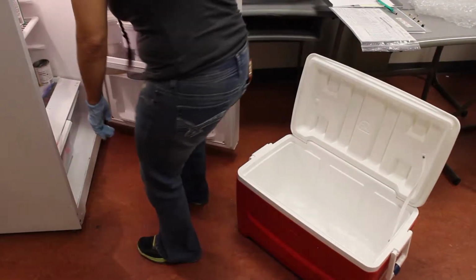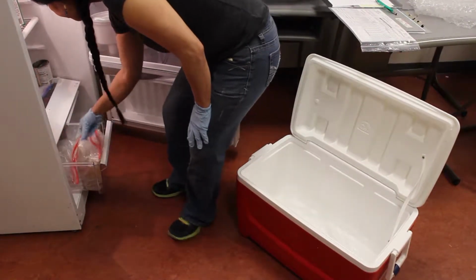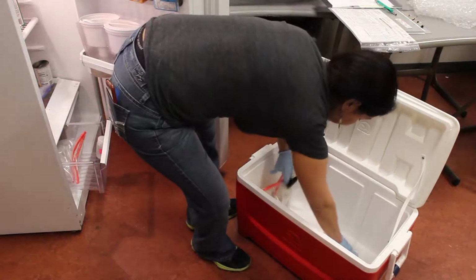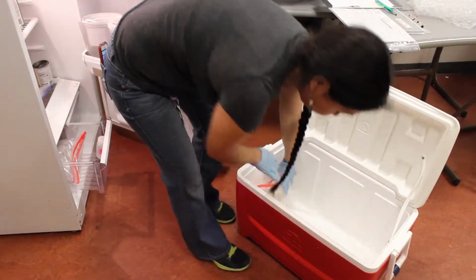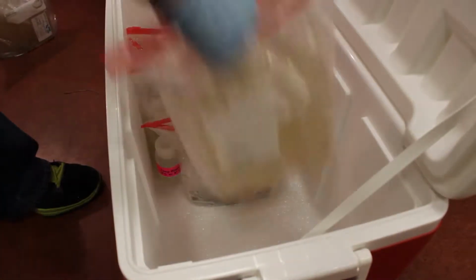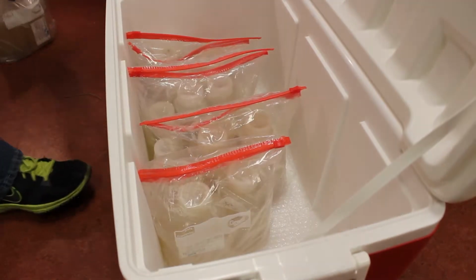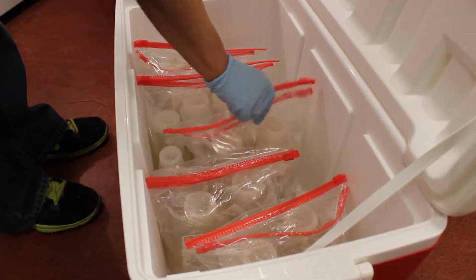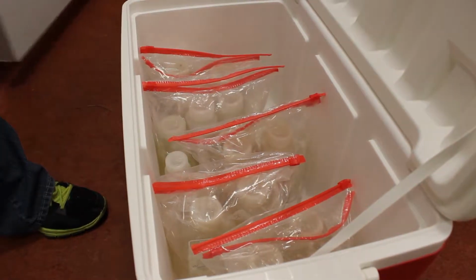When it's time to send your samples to the lab, remove them from the refrigerator and place them in the cooler. Your laboratory will inform you of the required temperature range and time frame for your samples. It is critical to follow these laboratory instructions for any successful sampling event.